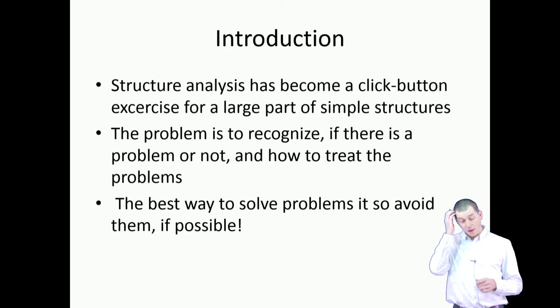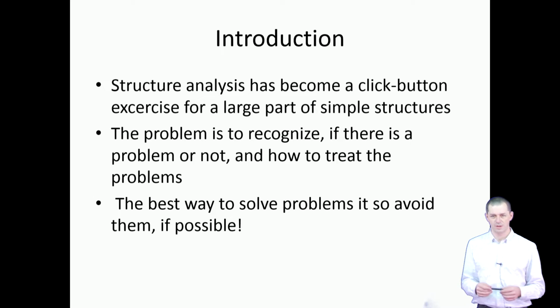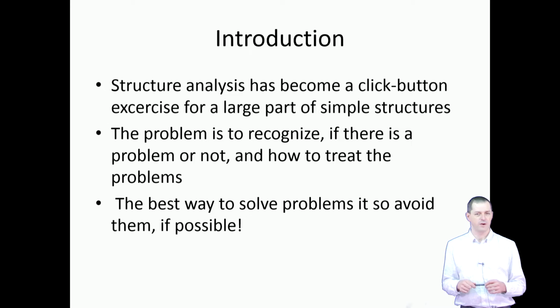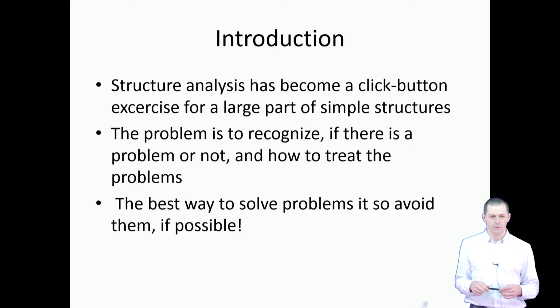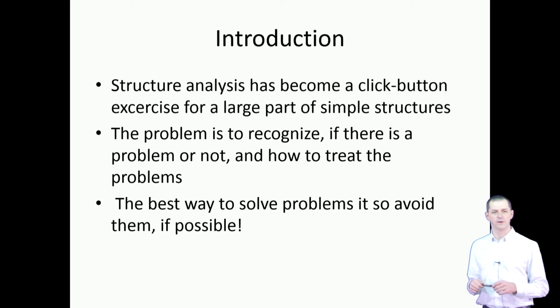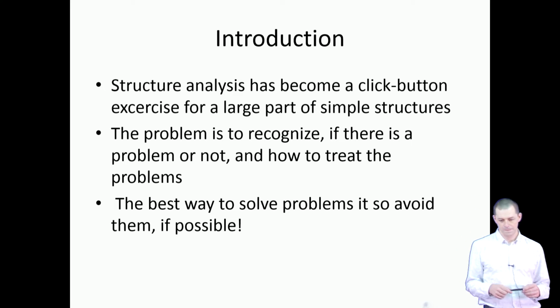On the other hand, the modern programs are so powerful and the options are so versatile that even if you do not have a perfect data set, and of course I know that sometimes it's simply not possible to collect a perfect data set because there are no perfect crystals, even if you do not have a perfect data set, with the modern software for data reduction and then structure refinement, you can get good results anyway.